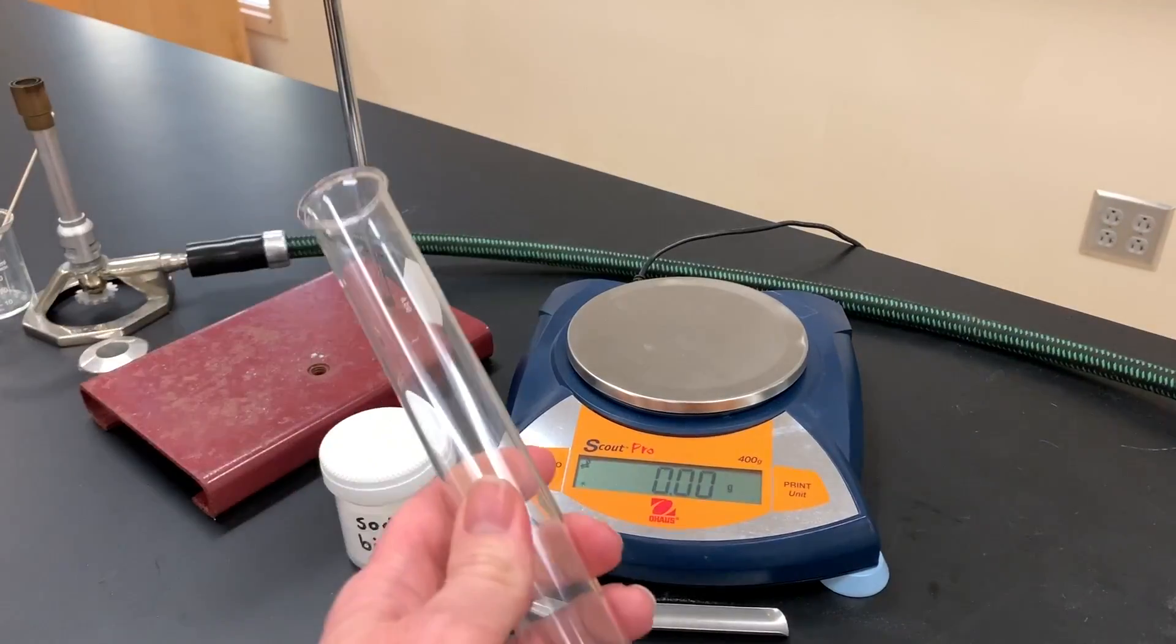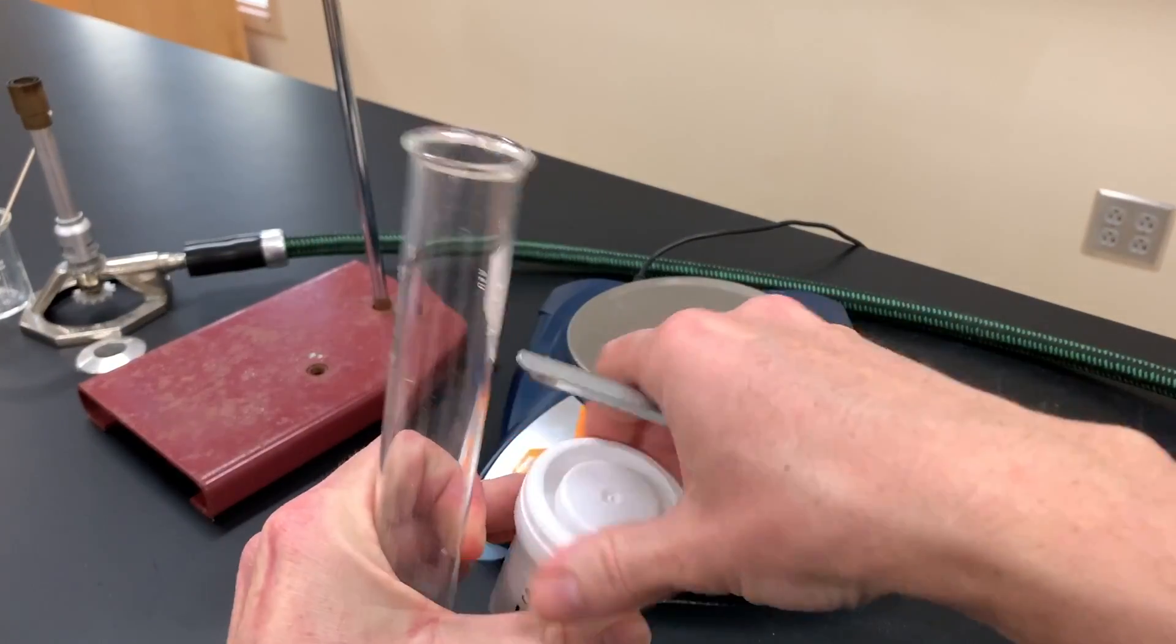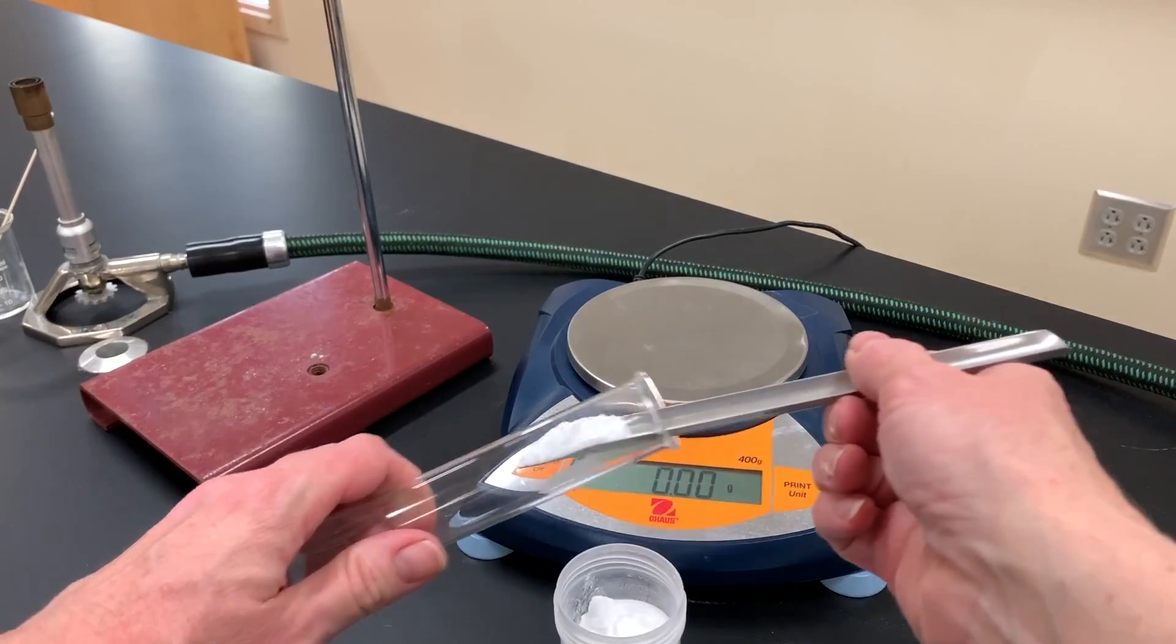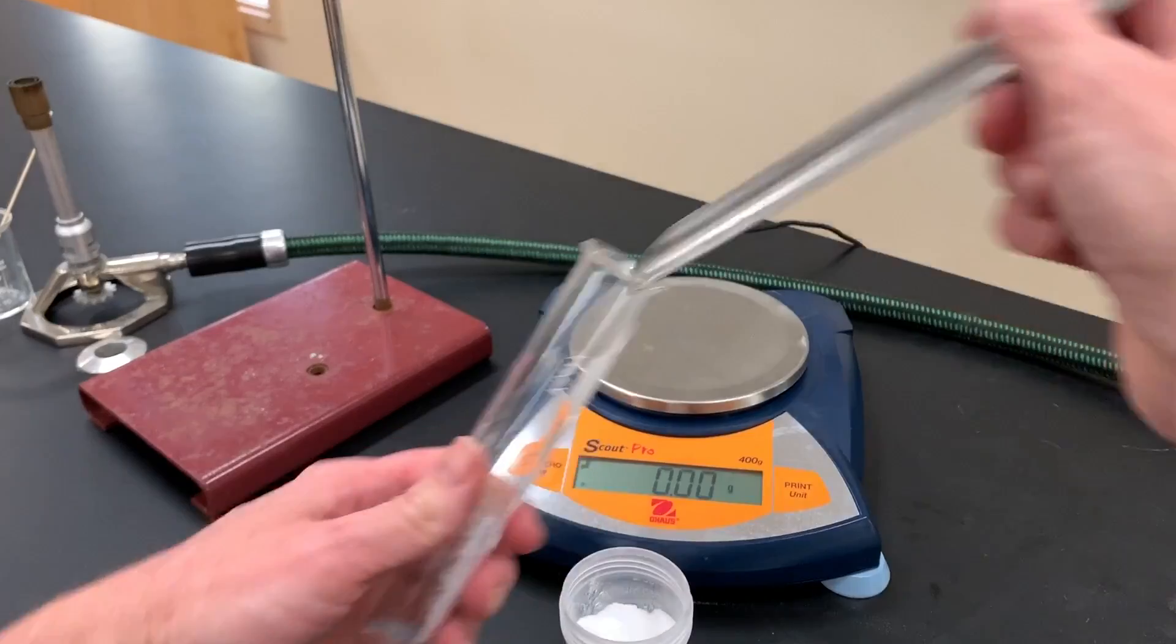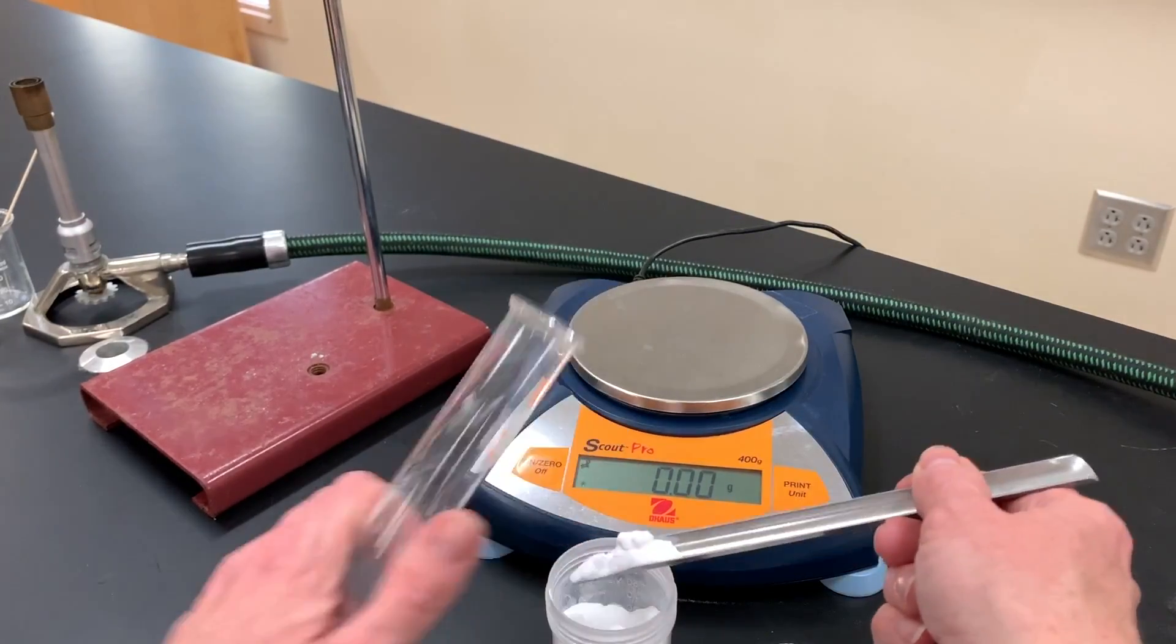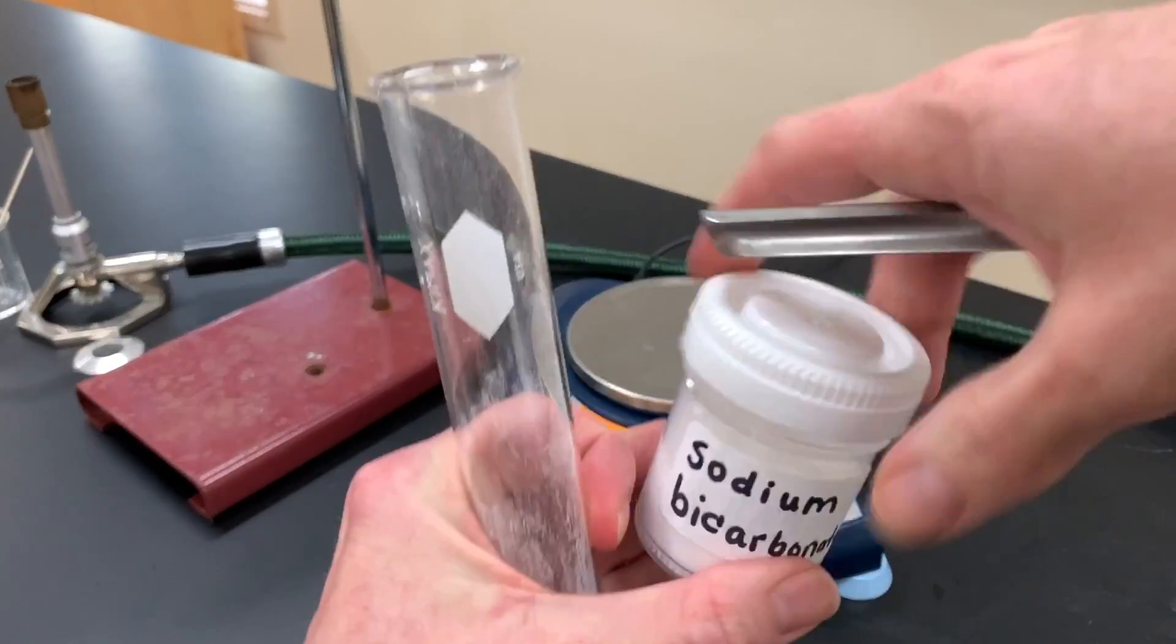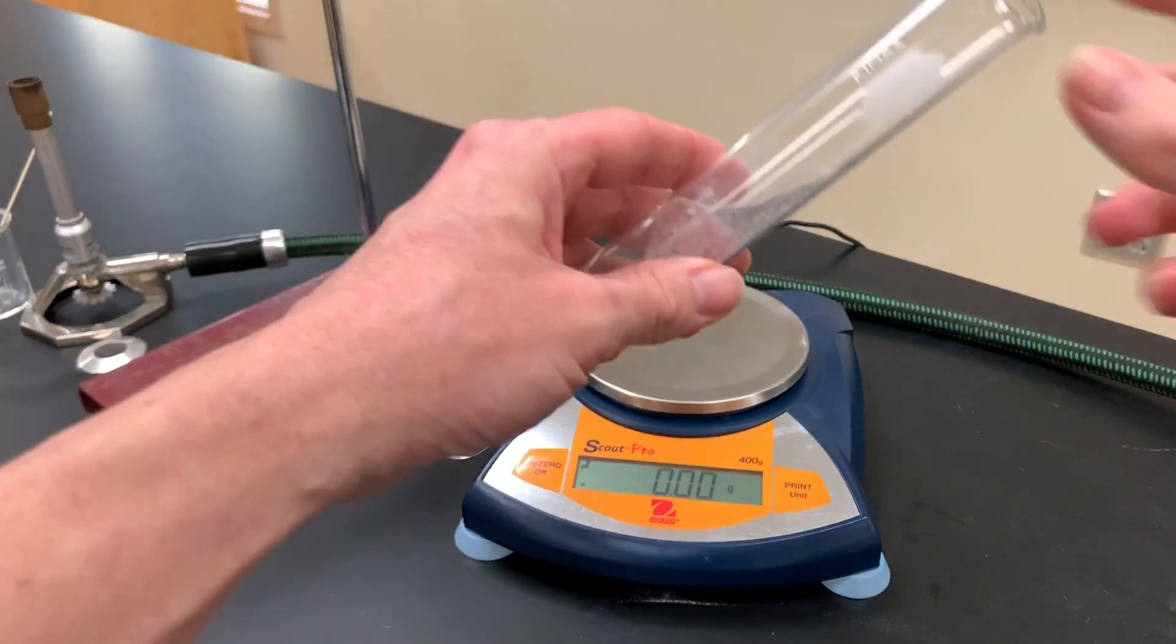The next step is to grab your test tube, a scoopula, and your sodium bicarbonate and add, in my case, about three scoops full to the bottom of the test tube as best as I can. The amount really doesn't matter as long as it's not too much to heat and you've got enough to measure a change in mass with the balance that you have.